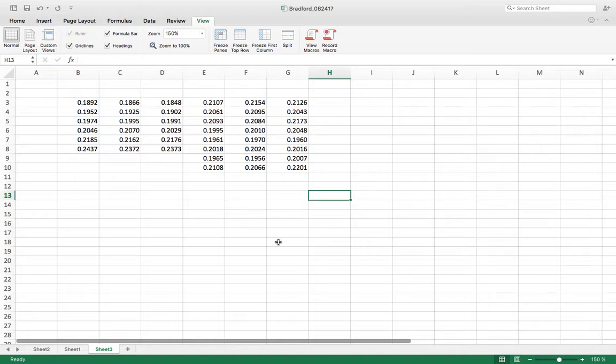The key thing is measuring and seeing what proteins do. And the first step to do that is to see how much of them you're actually dealing with. So we're just going to see the raw amounts. A Bradford test is the first thing you do before doing a Western blot, so you know how much protein to put into the test, and you can then see a specific protein later.